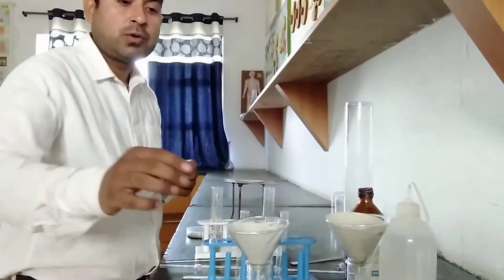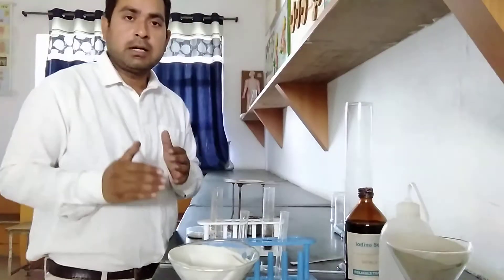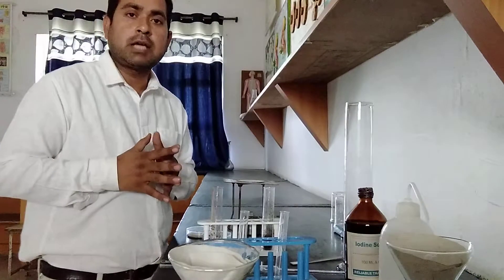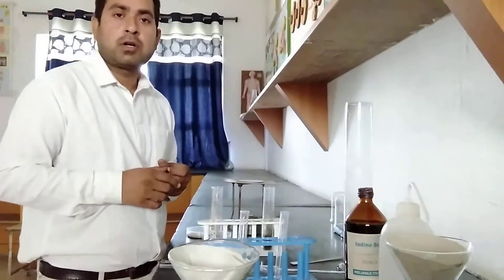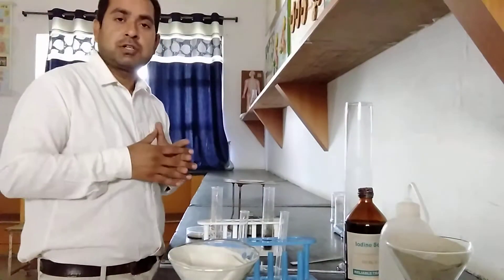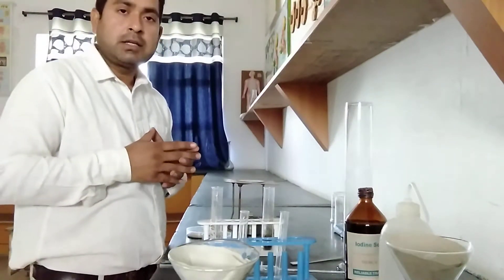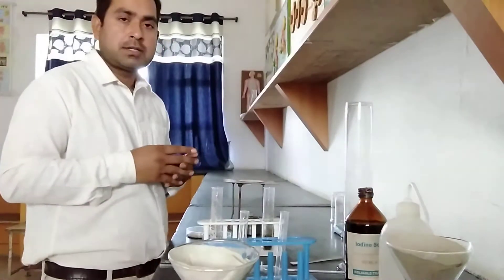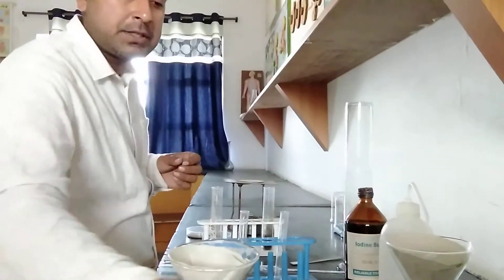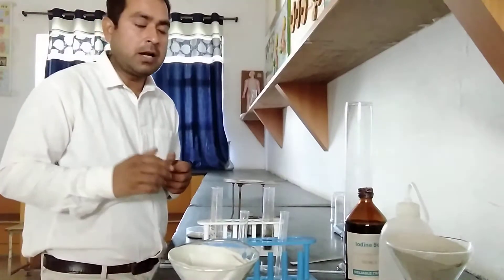I am going to explain related to water holding capacity of soil, and I will cover four related experiments for water holding capacity. This topic is important for CBSE class 12th board students, and they are very interested to do this if they are permitted to the lab. On the basis of agriculture also, this experiment is very interesting and useful. First of all, I am going to tell the basic requirements to check the water holding capacity and different measures.